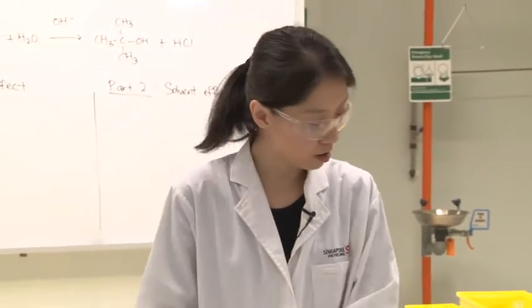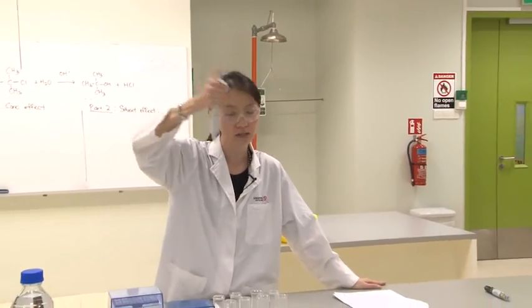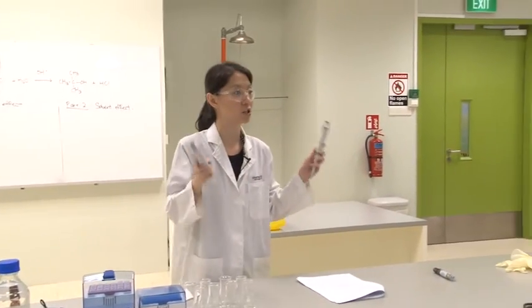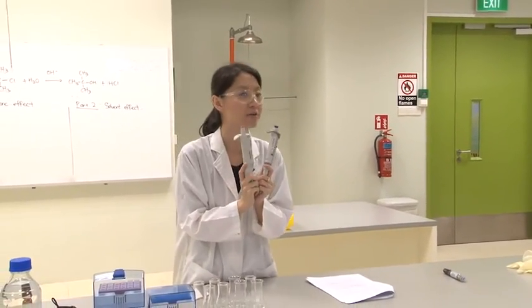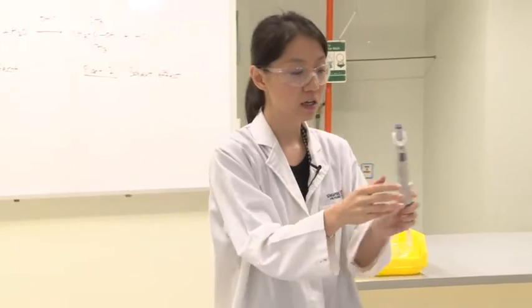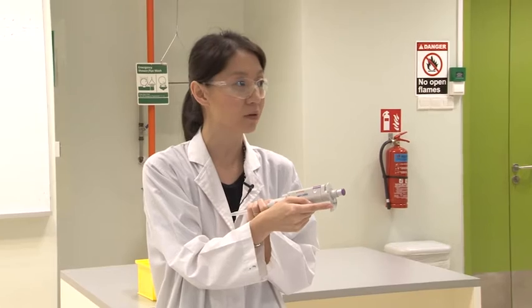Just a quick recap on your pipetting technique that you have learned in year 1. So this is to tap on your prior knowledge. So first, each group of students today will take a pair of micropipettes, the 5 mL and the 1 mL, right? So for the 5 mL micropipette, make sure you look at the maximum volume that you are able to pipette, that is 5,000 microliter.